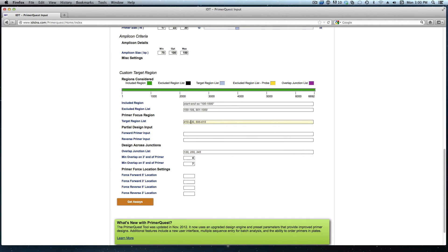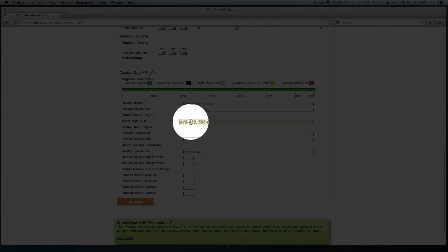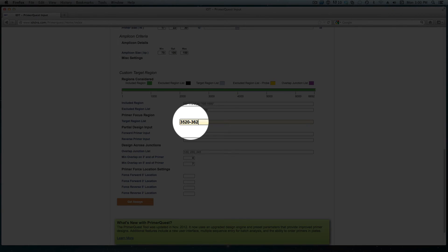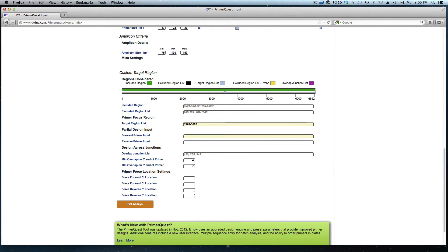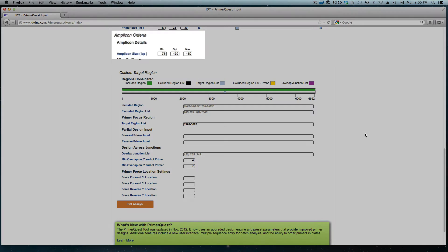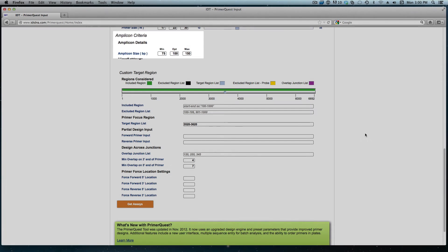For this specific design I want the primers to flank region 3520 to 3620. So I can type that into the box here. One thing to know is to make sure that our amplicon length is large enough to cross that region. As you can see the amplicon size is currently set from 75 to 150 so that won't be a problem in this case.